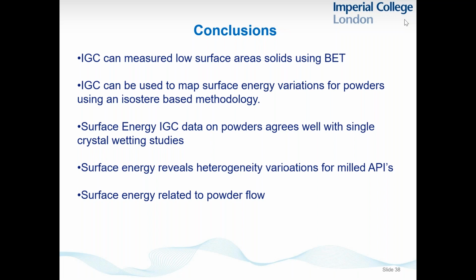And even something simple like powder flow can be related to surface energy, which is an important property.